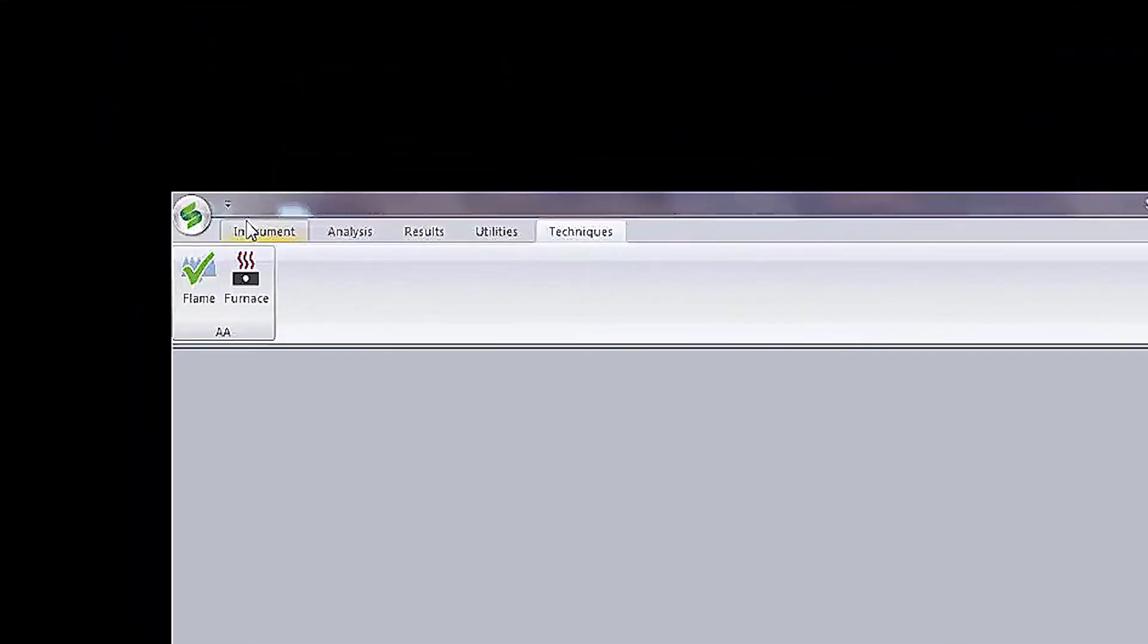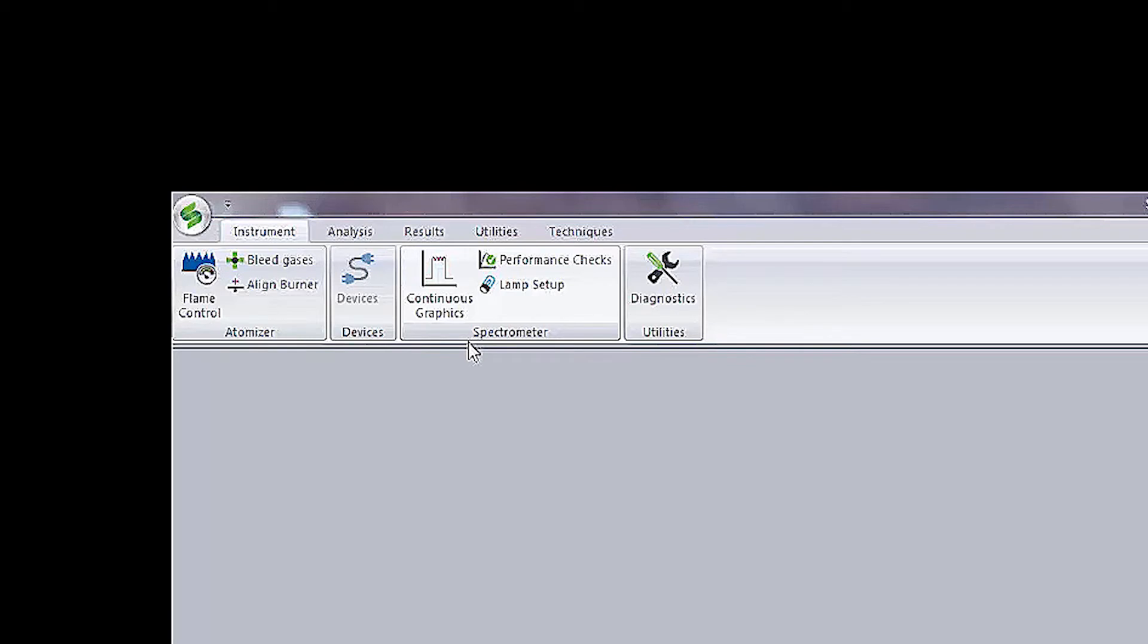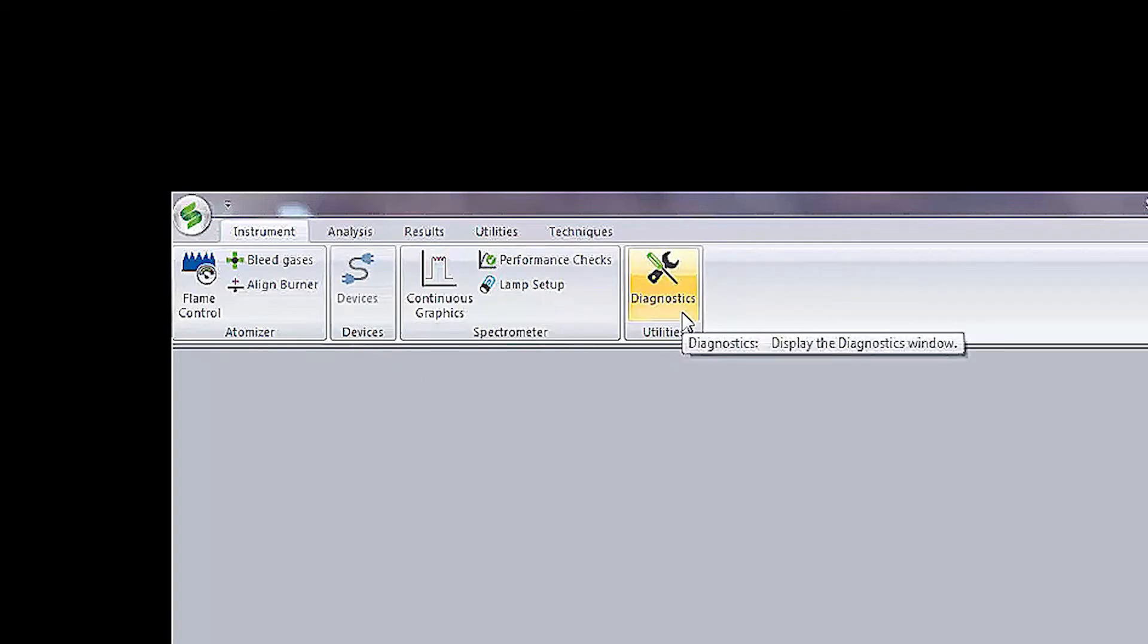The first is the Instrument tab. This is where you can control the atomizer and the spectrometer, as well as control other devices like an autosampler and view system diagnostics.